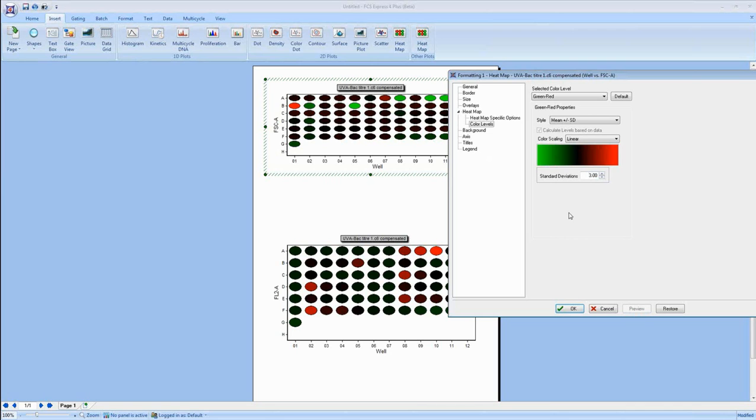In this case, we're looking at events, so using a linear color scaling is probably a pretty good idea. But if you're looking at data that has a wider dynamic range, I mean, maybe you're looking at fluorescence data. In particular, we're looking at this Accuri data, which has essentially a dynamic range from 0 to 10 to the 7th. Not that we ever use all of that range, but if you were, you could choose logarithmic. And if you notice when I click Preview, when we use logarithmic scaling, it's going to change things to use that new logarithmic scaling to assign heat to everything.